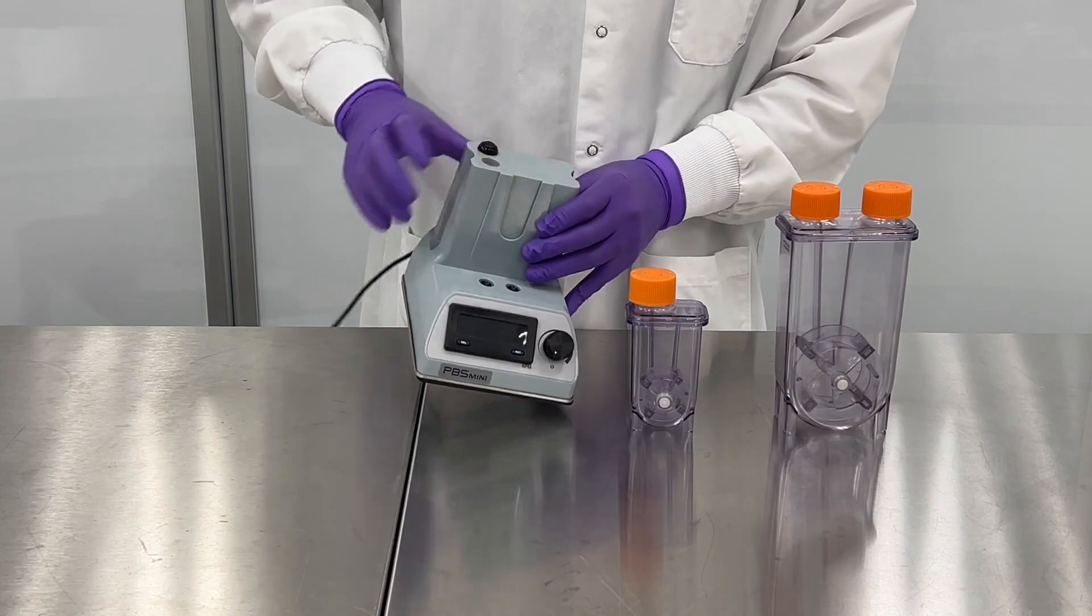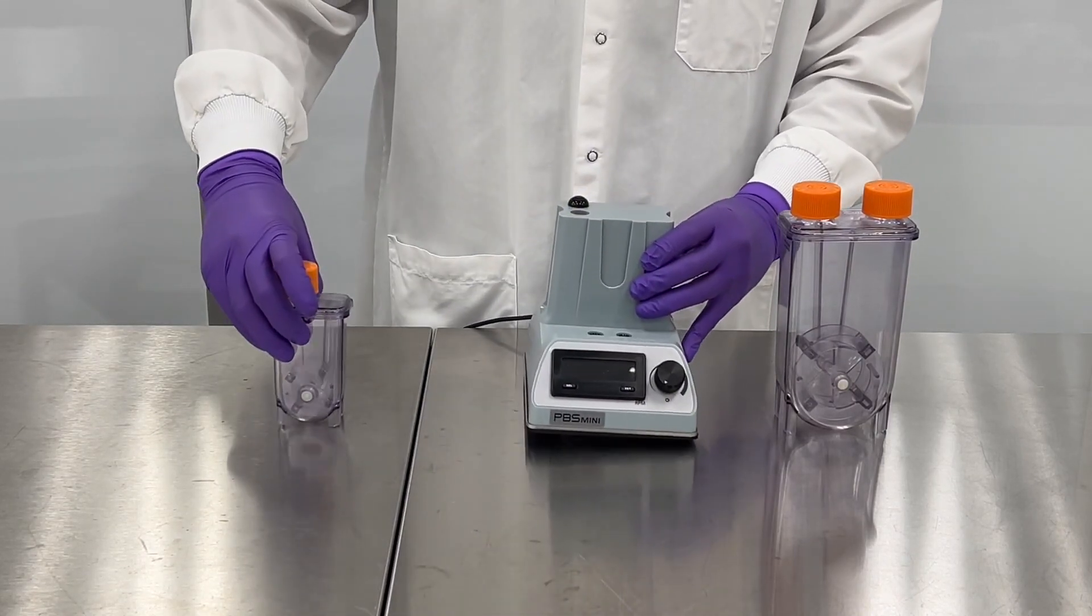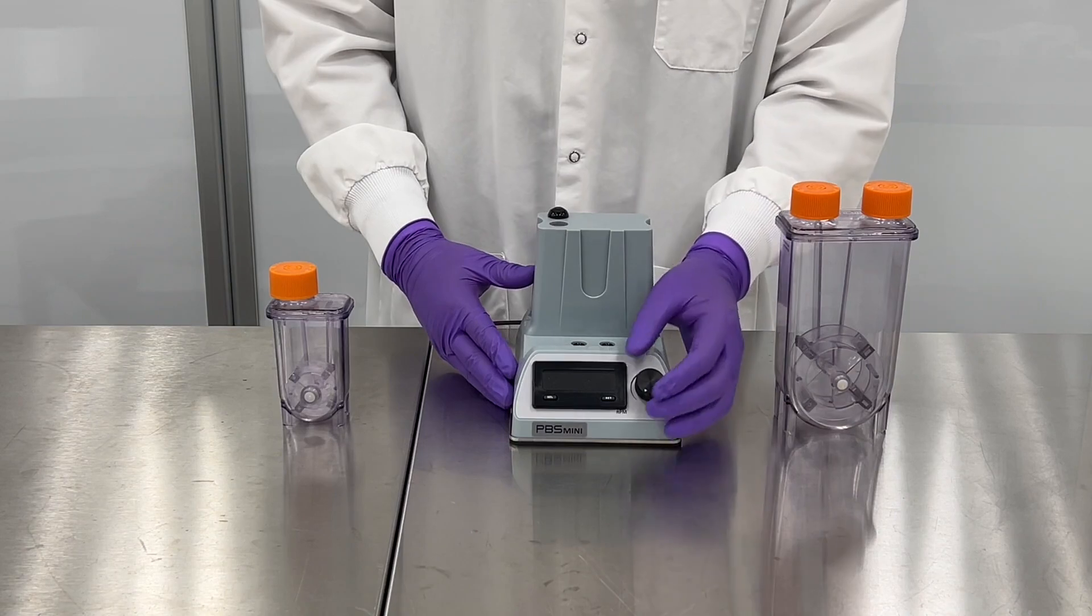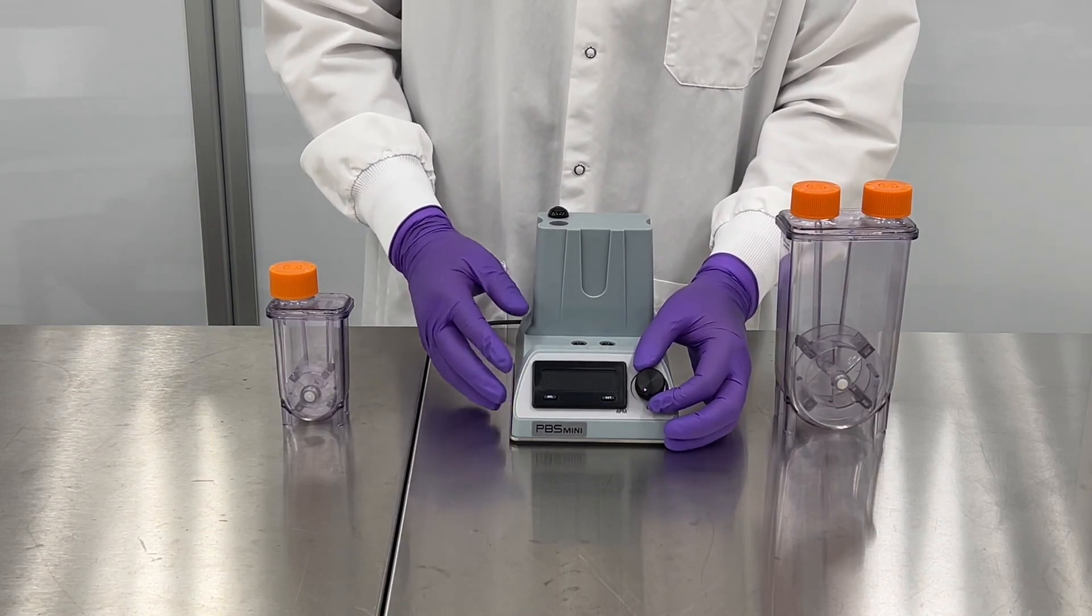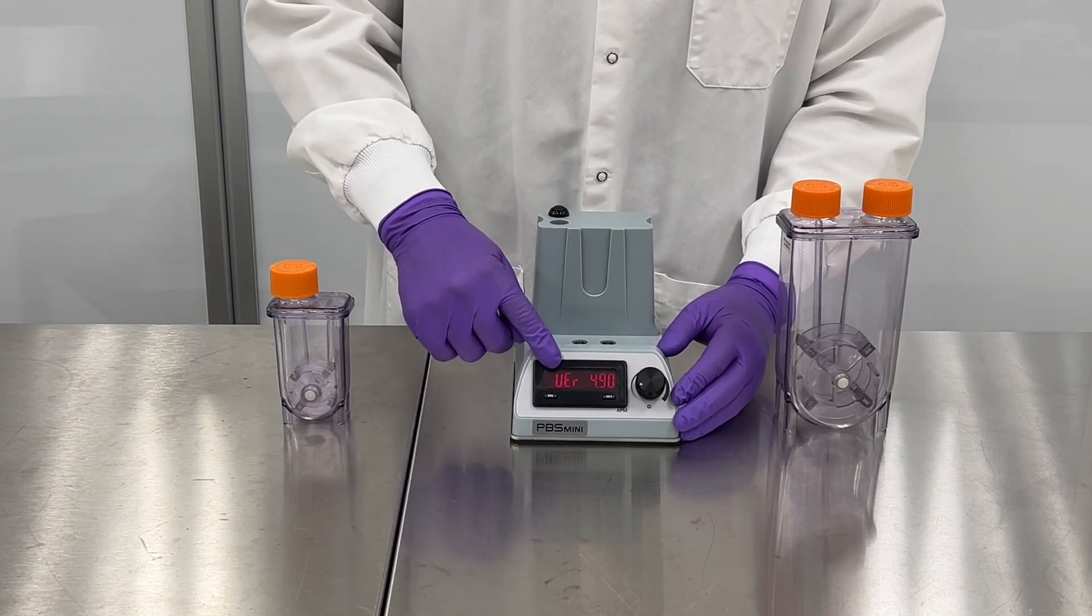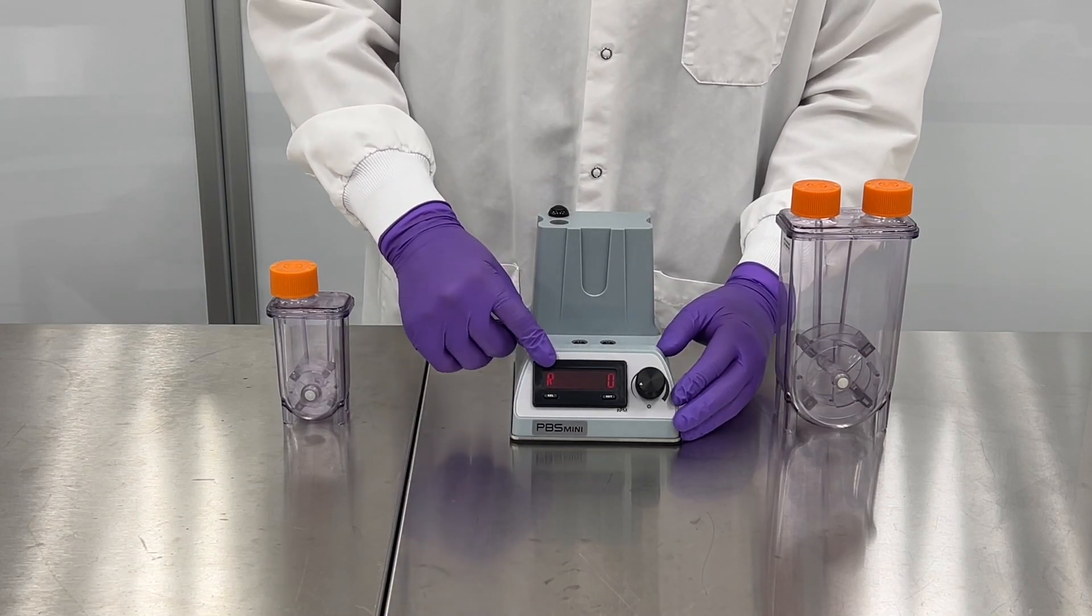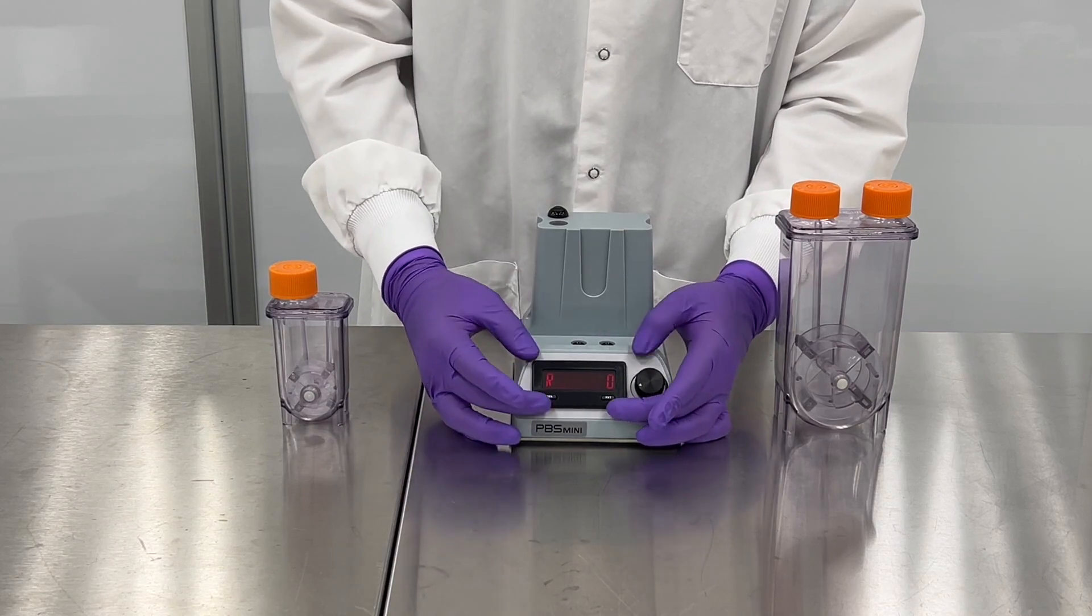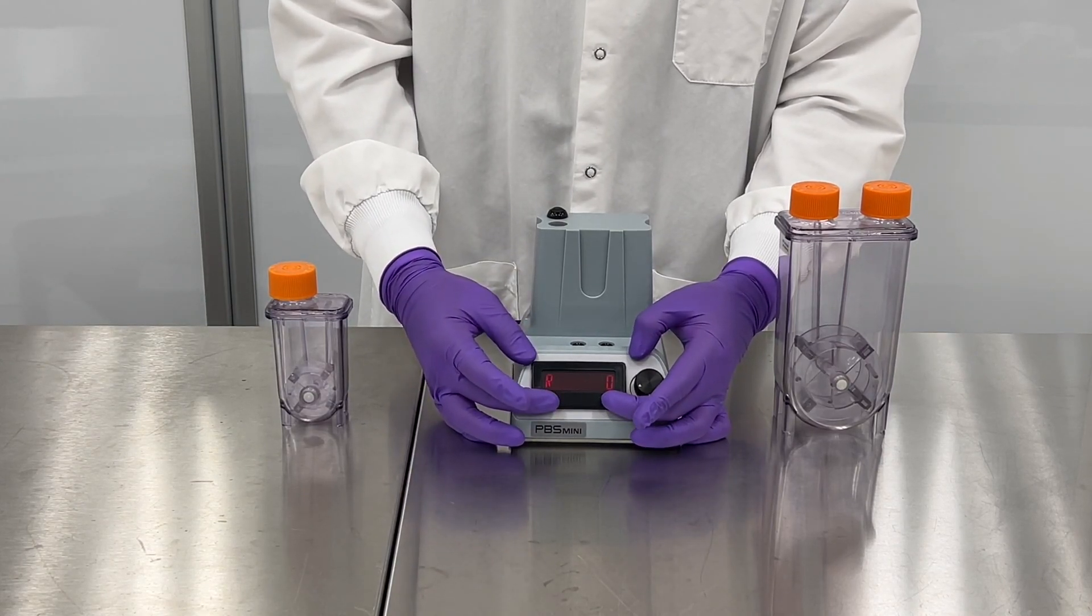So here I have the mini base. I already have it plugged into some standard AC power and looking at the functions and features of this we have our speed adjust dial that actually also activates the screen. This speed adjust display will show your speed in RPM and then we have these two buttons right here that are exclusively for factory settings so they won't be functional at the customer site.